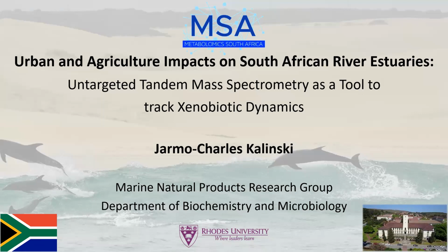So he does LC-MS based untargeted metabolomics. And he says it's a powerful tool for environmental monitoring of xenobiotics. So in the study, he applied this approach to analyze dissolved organic matter, which he calls DOM, from aquatic samples. And yeah, they're collected in Algoa Bay in South Africa and its tributaries, the Swartkops and the Sundays rivers, which represent urban and agriculture impacted estuaries, respectively.